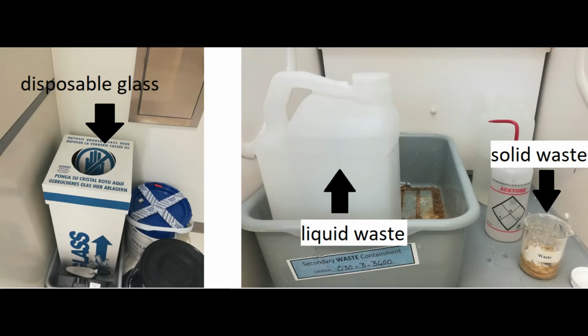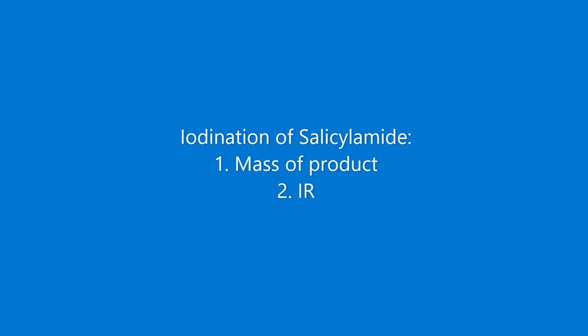Once the experiment is done, you throw away your liquid waste in the liquid waste container, solid waste in the solid waste beaker, and then you clean all your glassware, first with an organic solvent like acetone. And once everything is clean, you also rinse your glassware with distilled water. Then you just throw away any broken glass in the broken glass container, and that's it.